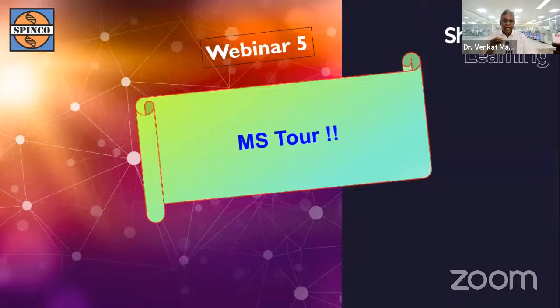After seeing the number of participants, after seeing the overwhelming enthusiasm among the participants, I shall once again introduce the mass spectrometer from the beginning. Today's presentation, what we have decided is, we not only talk about how to connect a mass spectrometer with a liquid chromatography, but also how to connect with a gas chromatography. Gas chromatography or a liquid chromatography, both will act as a sample introducing device in a mass spectrometer.